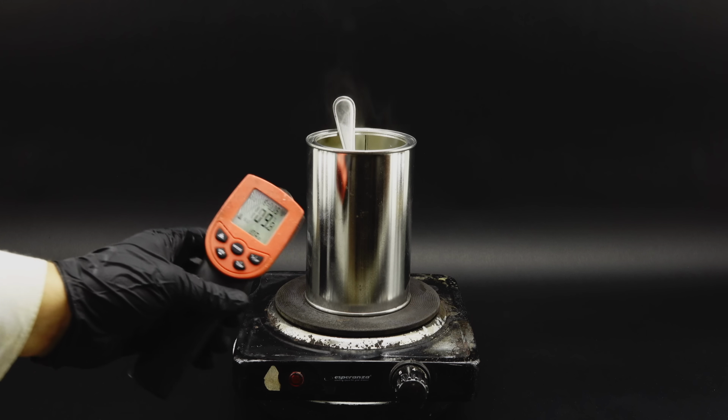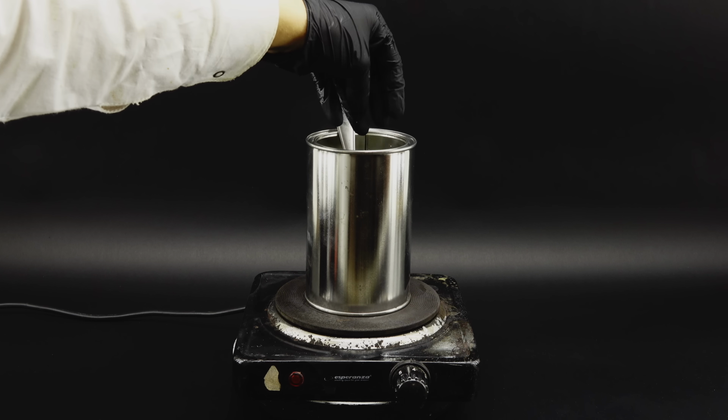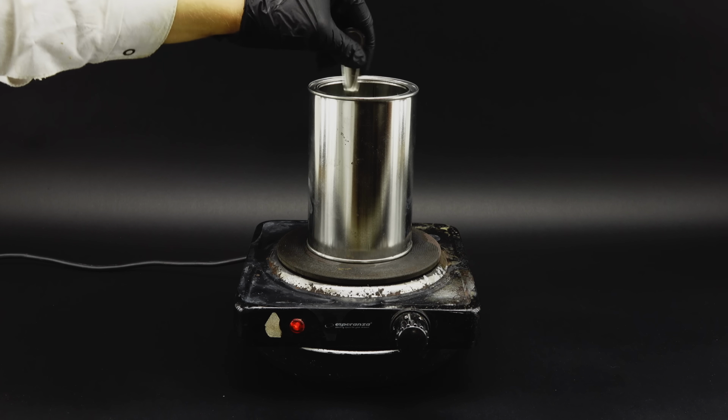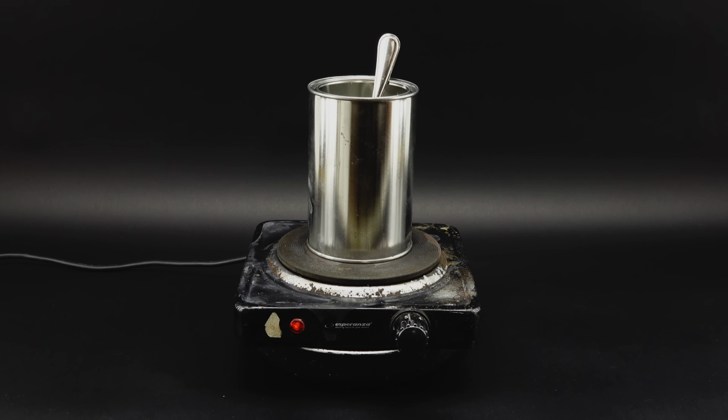When it got to temperature, I started sprinkling in the plastic, and this time there were fortunately no signs of boiling. Nonetheless, I watched the reaction closely for its whole duration, as if that tames it somehow, and now that I got this process working, I can finally talk about what's going on here.